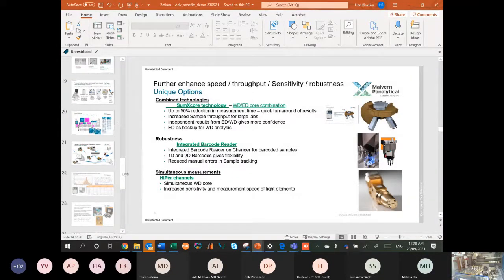Of course, there will be some overhead times to load and unload the sample. You could add another minute for loading, unloading, moving the optics, and all that. So in about 2 to 2.5 minutes, you're able to have a turnaround of measurement.